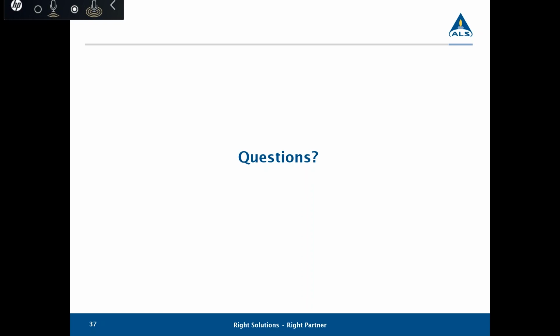Amy says, is there a way to differentiate natural F4 exceedances? Not really, because F4 usually comes as an unresolved complex mixture most of the time, since those are the heavier hydrocarbons.